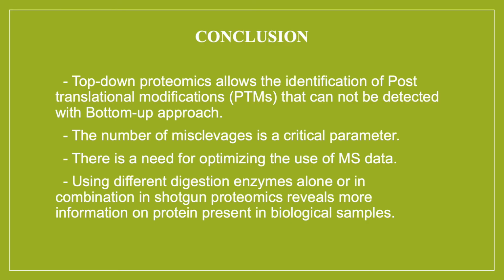Let's recap what we've spoken about today and give you some take-home messages. Due to time limits, we cannot present all the results, but here are the main points that may be useful. First, depending on the research, different proteomics strategies can be selected. For example, top-down proteomics allows the identification of PTMs that cannot be detected with the bottom-up approach.